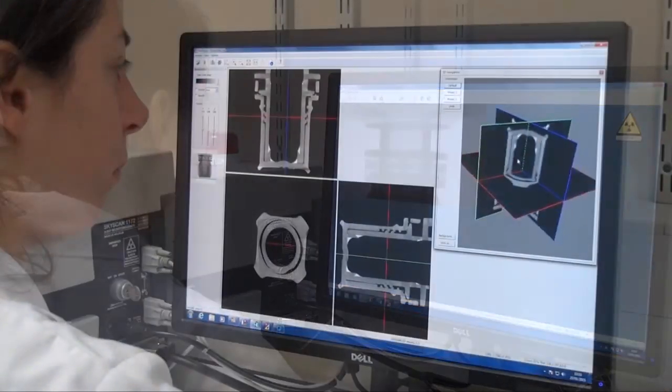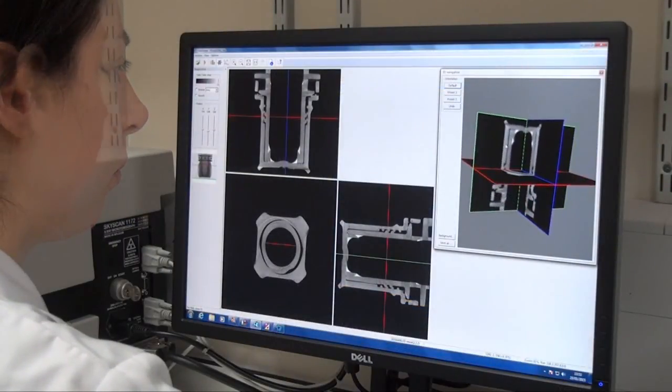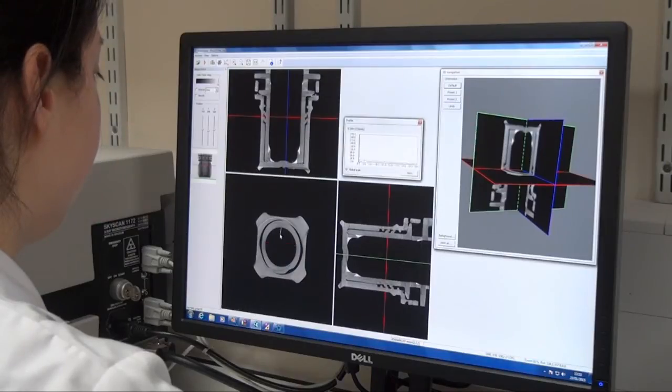Here, cross sections of any part of the cap can be viewed without the need to cut it. This can highlight defects or weaknesses and provide a range of measurements to check against specifications.